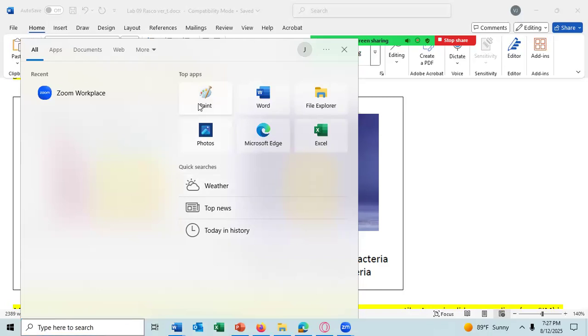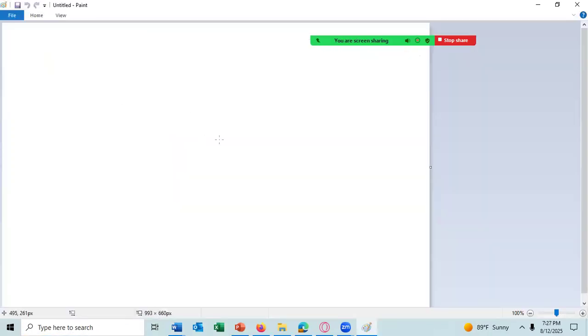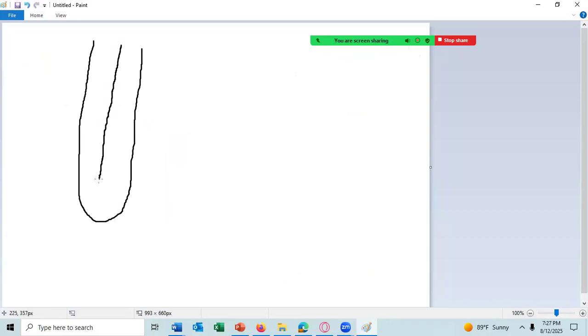If the bacteria is slightly motile, it won't be everywhere, but it will grow beyond the stab, and we call it the bacteria flare out of the stab. So here's the stab. And let's make the agar this way. So the bacteria will grow something like that.